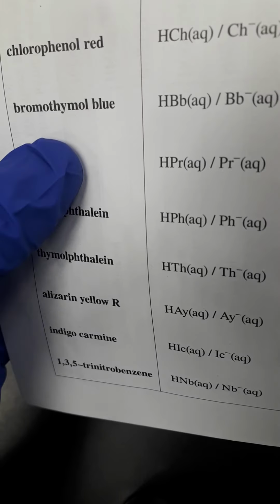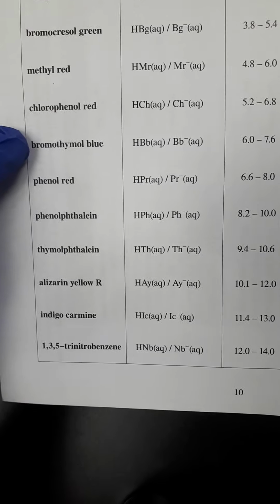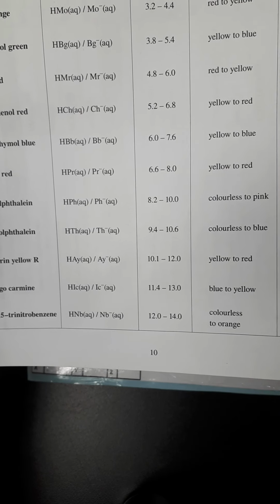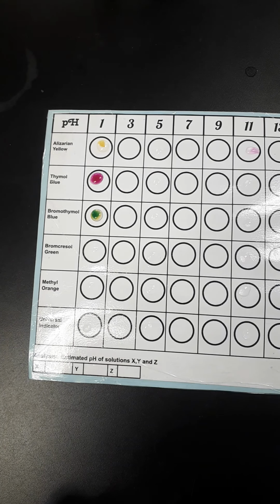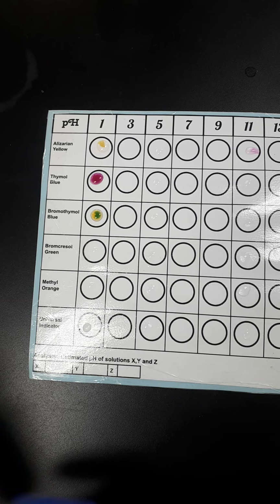Bromothymol blue. It's a pH of 1. Let's see. So right there, this might be hard for you to follow, but bromothymol blue right by my thumb should be yellow if it's a pH less than 6. So let's check it out. Oh, it's getting there. It's getting there. It's turning from green to a nice, neat yellow.